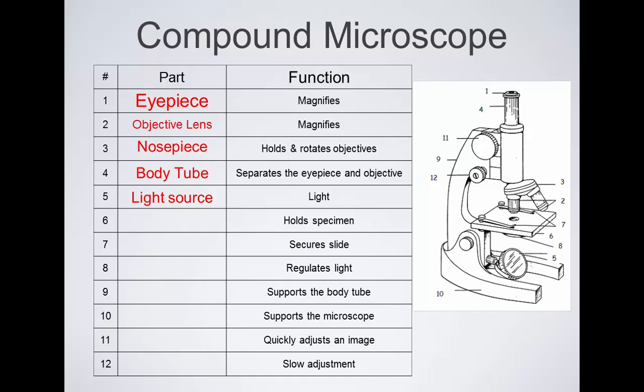It's called the stage. You guys use microscopes in elementary school? Yeah. No. Some did, but you're in a different district, right? Yeah.